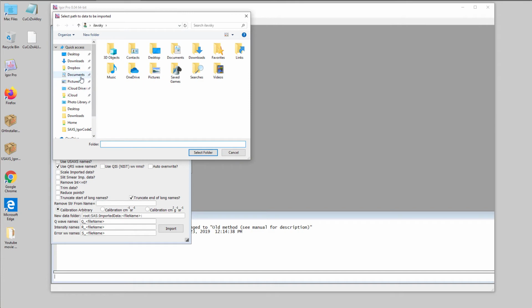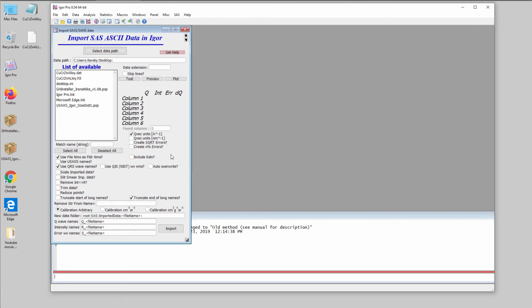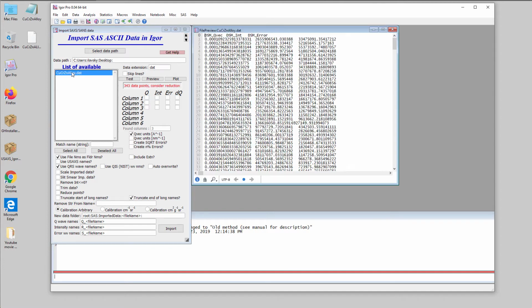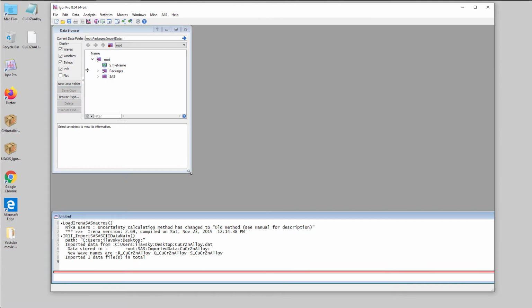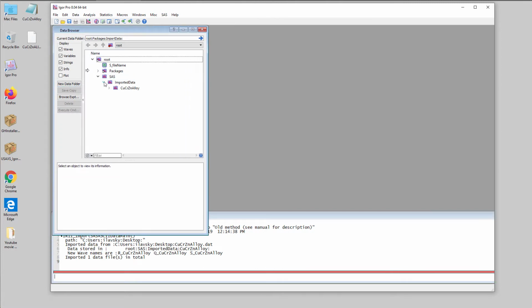We're going to go to, someone stole my desktop, and we're going to say this one is probably txt, now it's a .dat. So I'm going to select that. I double click on this, that opens up here. I can check the right checkboxes. There's not much else I need to do here. This just came from Irena. It is actually calibrated in centimeter square per centimeter cube per steradian, which is this one here. And I'm going to hit import. So now I have inside Igor the data in the folder SAS, imported data, and it says copper alloy here.